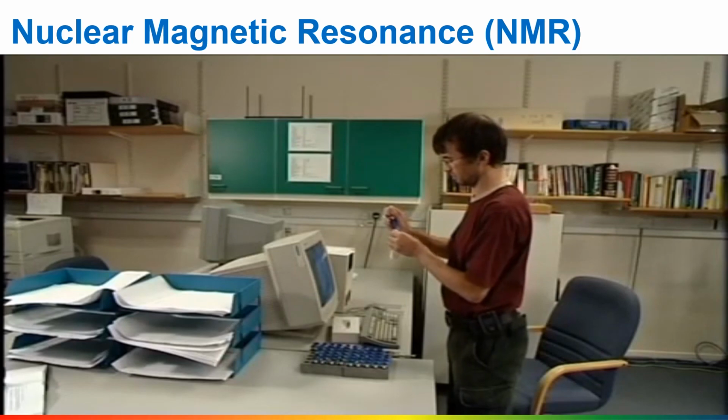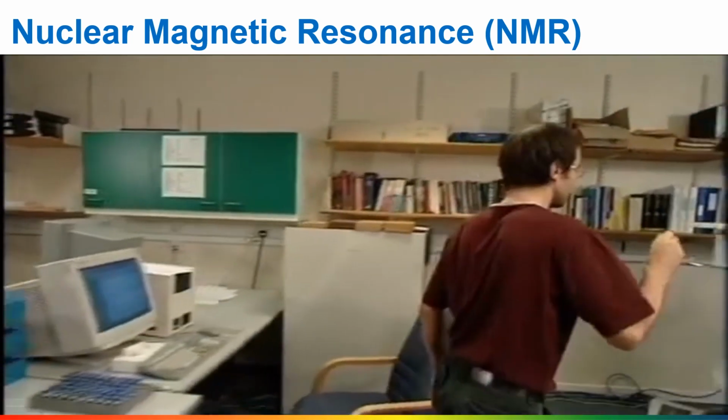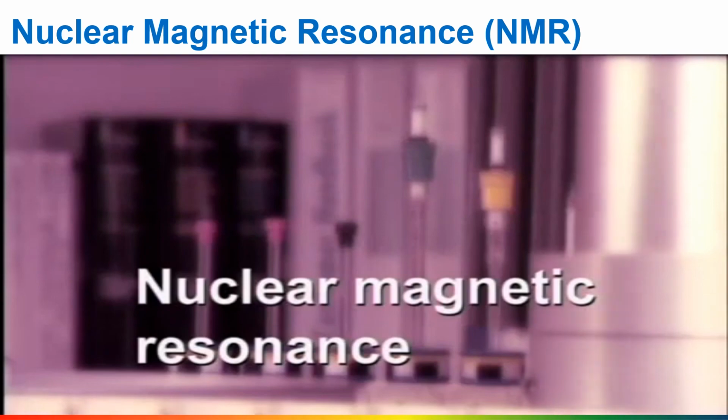Nuclear magnetic resonance, or NMR, is probably the most important technique for finding the structures of organic compounds. So much so that there is a saying, when the NMR goes down, the organic chemists go home.